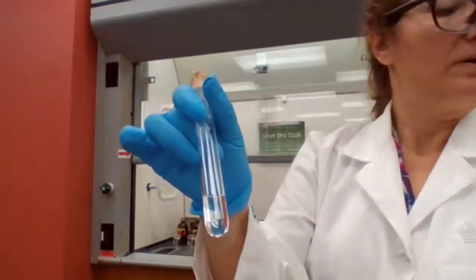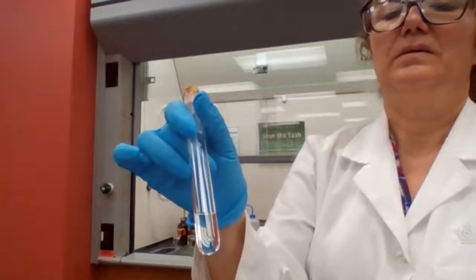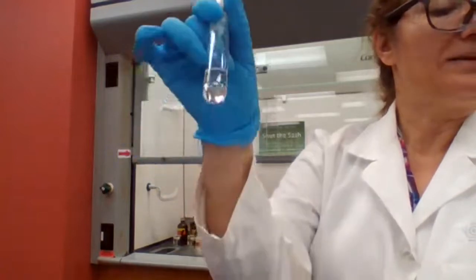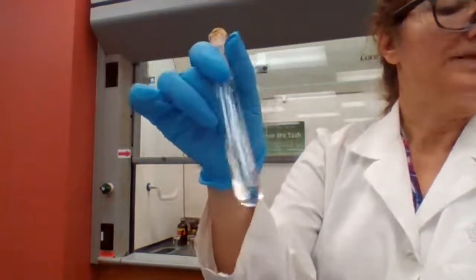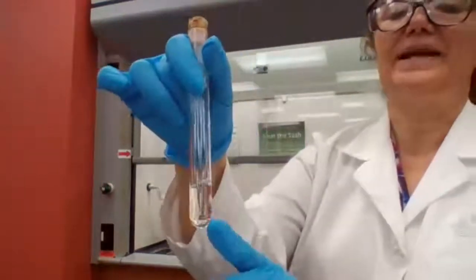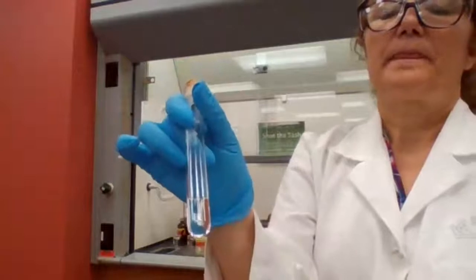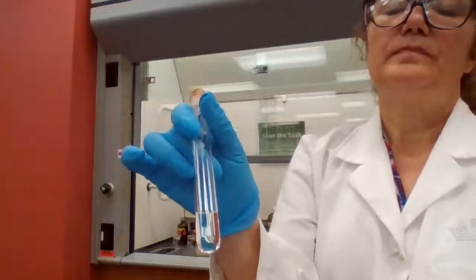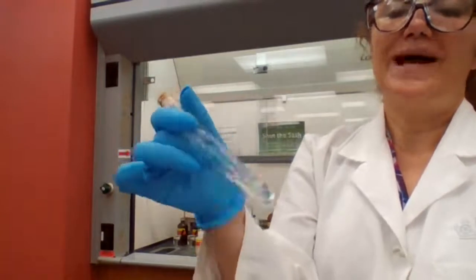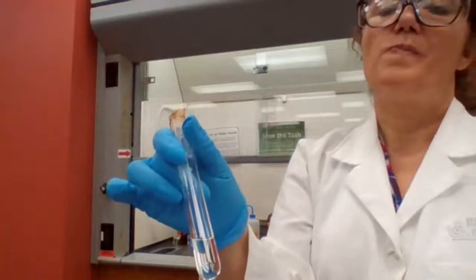Testing for silver nitrate test. I added a small amount of the solid sample and dissolved it in ethanol. What is my next step? If you look at your lab notebook, you should have it because you wrote the procedure, right?